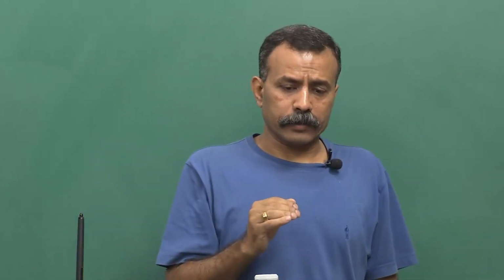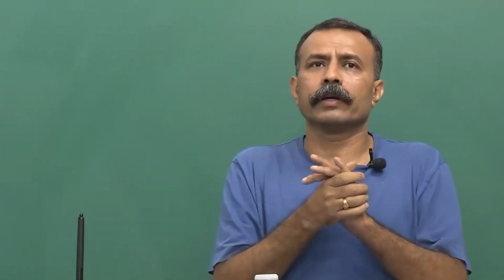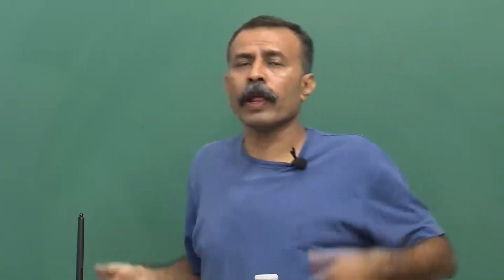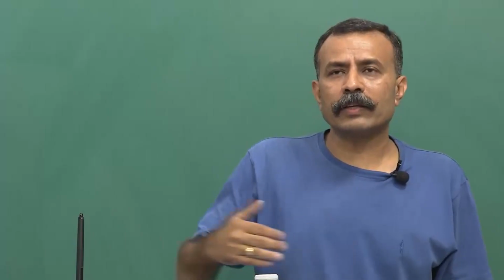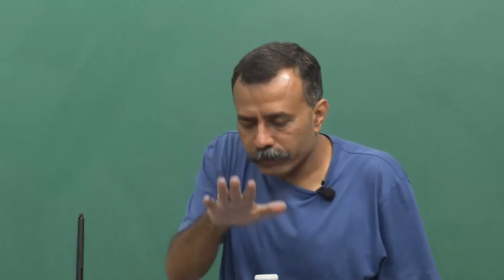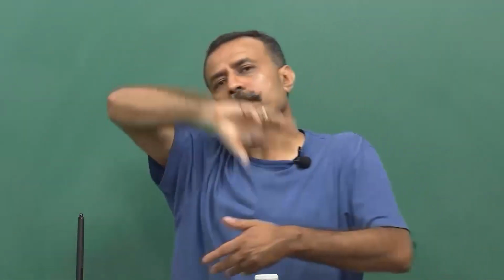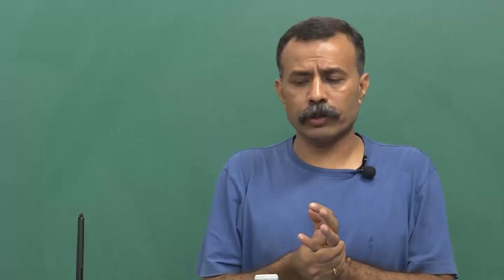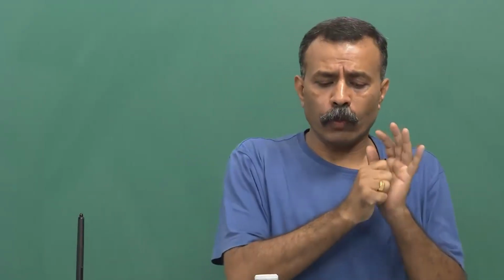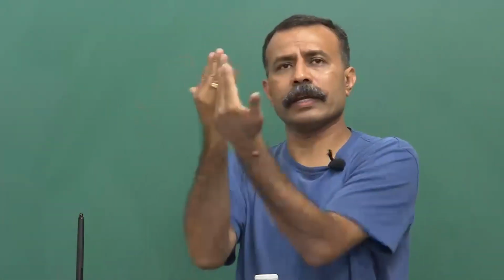Following the aseptic techniques, you must have seen all throughout, I'm repeatedly kind of hinting upon it, not really telling that you should do this, you should do this, but I'm kind of making you feel, as we are developing this virtual lab, how it will look like: have the sticky mats, have the wind or the current, have the room continuously circulating it, how you are going to work on the laminar flow hood, where you should put the laminar flow hood, where you can minimize the outside current flow, where you can have sliding doors.